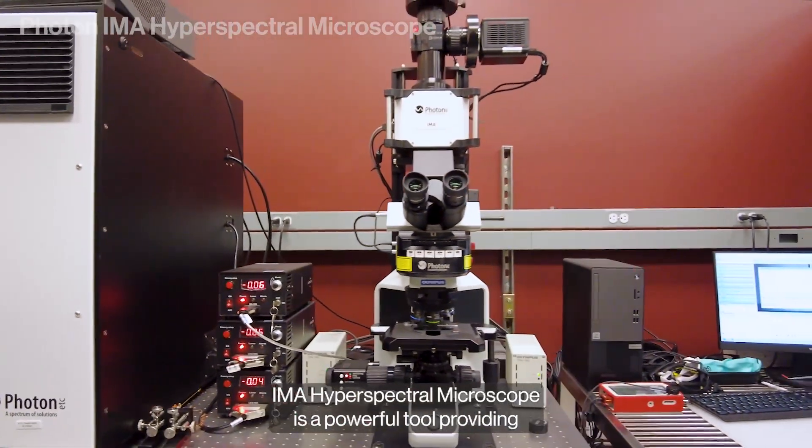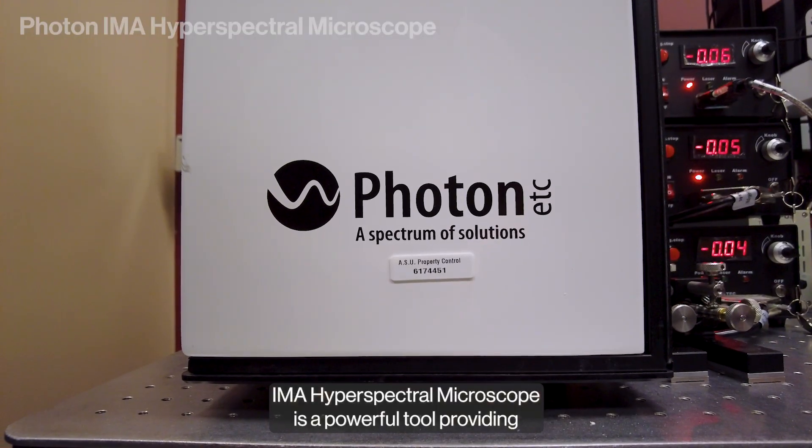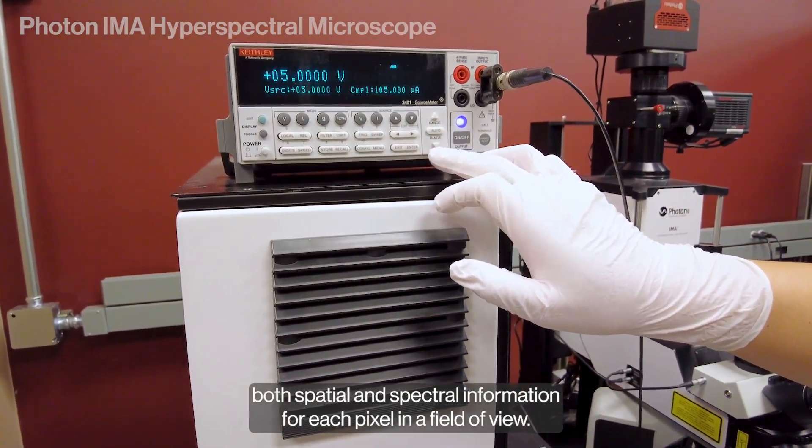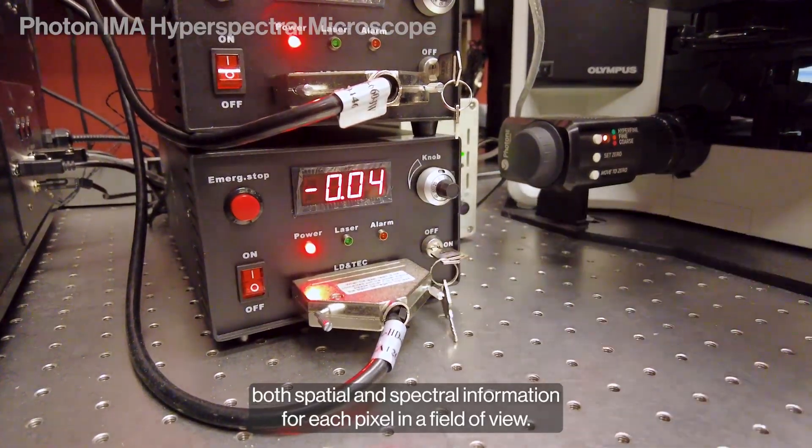The Photon IMA Hyperspectral Microscope is a powerful tool providing both spatial and spectral information for each pixel in a field of view.